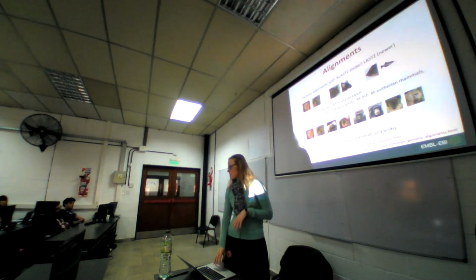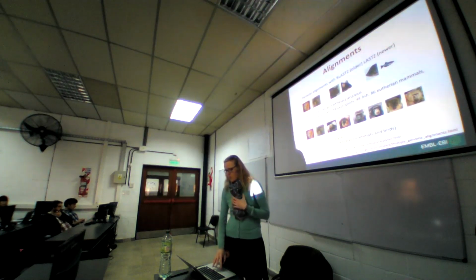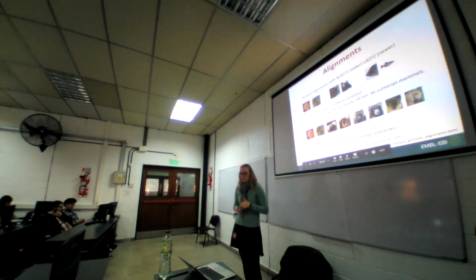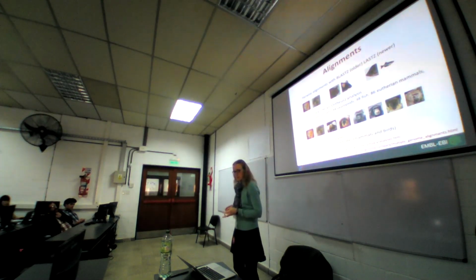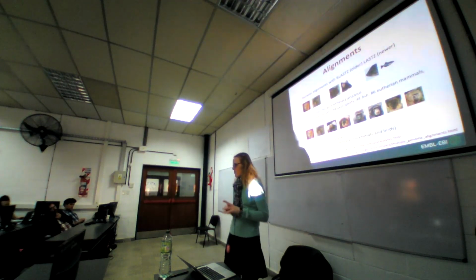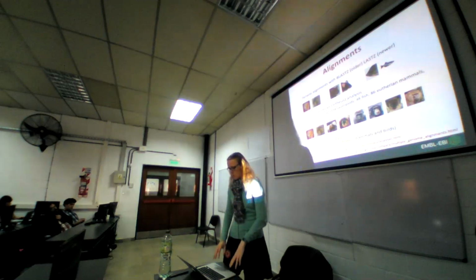So these are the alignments you have and that you can choose from. For the amniota, which include the mammals and the birds, as a set of 51 species, we run the Mercator-Pecan analysis, and this is because it's a bit more forgiving when it comes to differences between the genomes there.